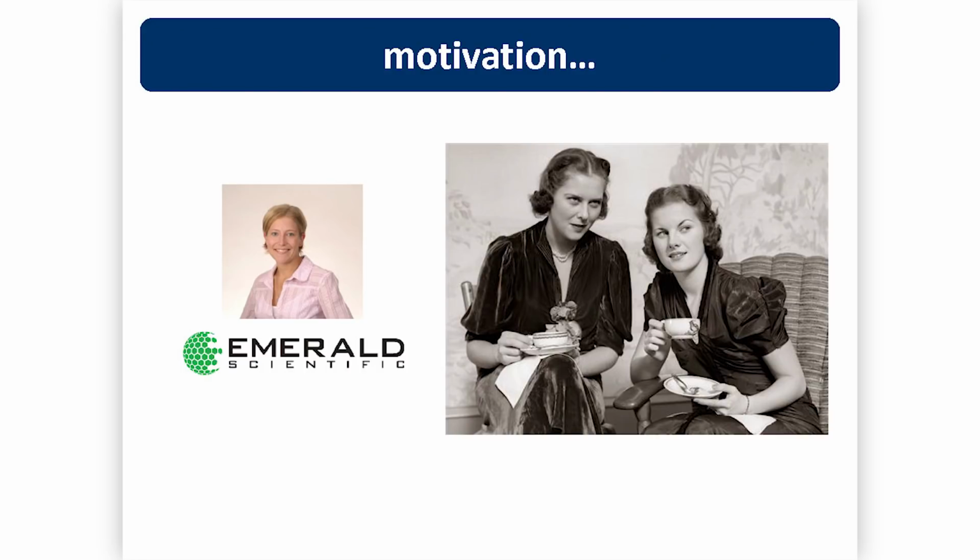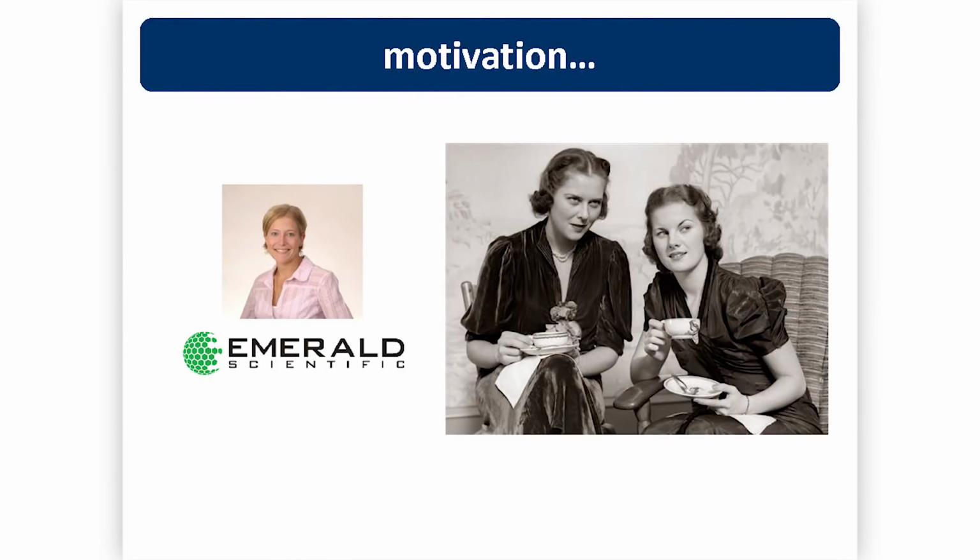The other motivation, this actually is really funny because in Josh's presentation, you had a picture of Amanda on a project that I'm going to talk about, the exact poster. Anyone that knows Amanda Rigdon, we worked together at ResTech for many years, worked on projects, and she's an excellent chemist. She got into cannabis pretty early while still at ResTech, and we started discussions about potency and the complexity of the plant and UV analysis. Because I'm a mass spec person, for me to go to UV and have confidence in it is a little bit difficult. So we always looked at that with a little bit of suspicion. Do we really have the selectivity that we need?